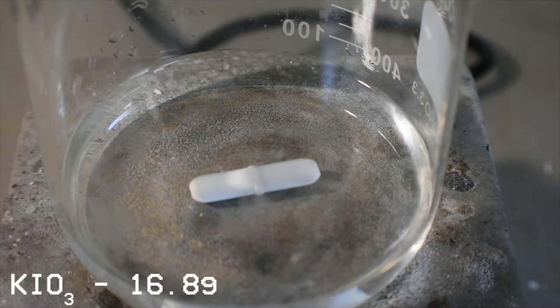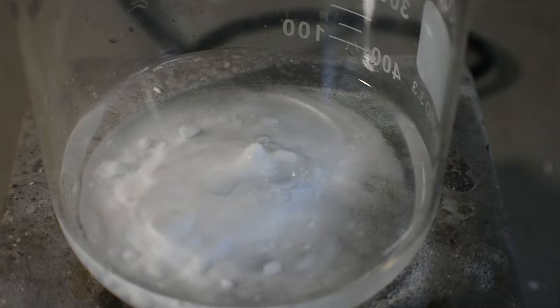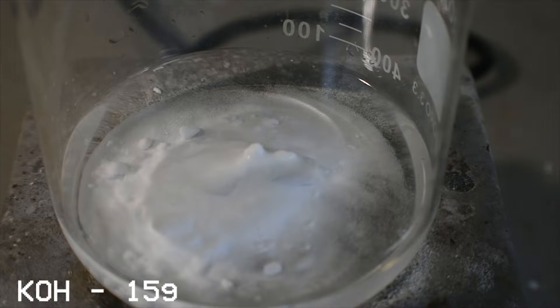Now, 16.8 grams of potassium iodate are added to the water. This most likely will not dissolve, and that's okay. Stirring is turned on, and 15 grams of potassium hydroxide are added, and the solution is heated until boiling.